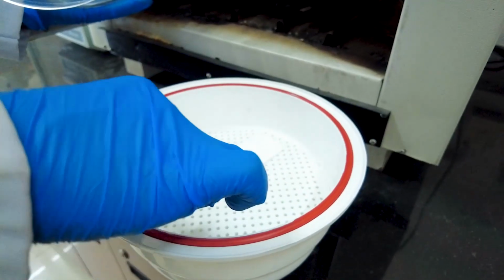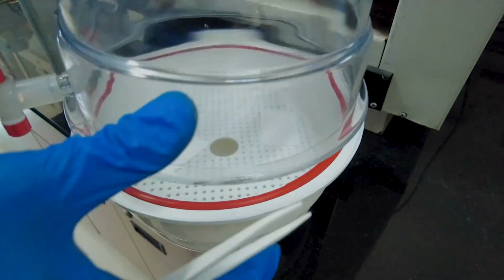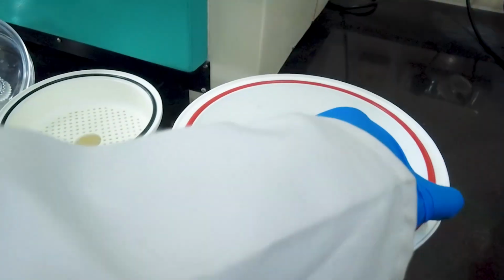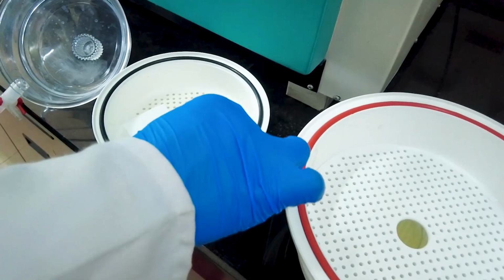After that, flip the fibers. Once it is done, place the fiber in another desiccator. Leave it overnight for evaporation of glutaraldehyde.